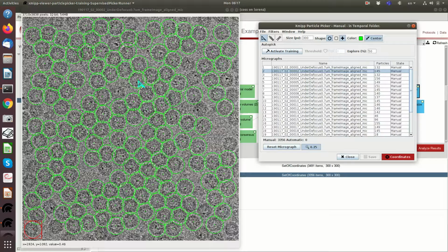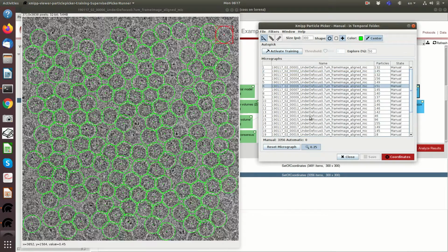You see that I cannot see any, and we can also see that by this 2D classification we have gotten rid of the particles with iron. Not all of them. This one has iron, this one has iron, and it was attracted by one of the images or one of the classes without iron. So this is a good example that not all the images supporting a class are absolutely represented by that class average. Sometimes these algorithms also commit errors.